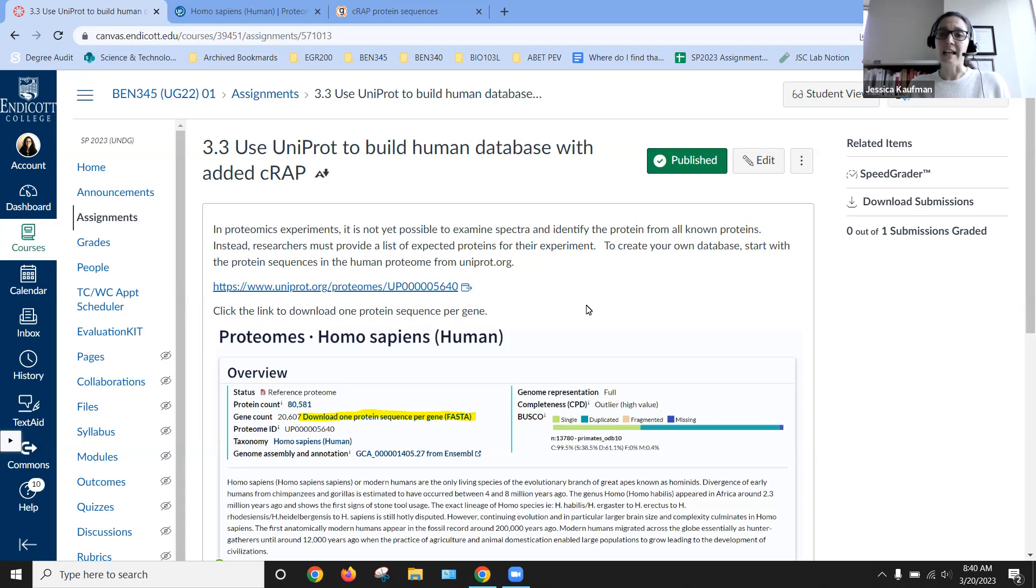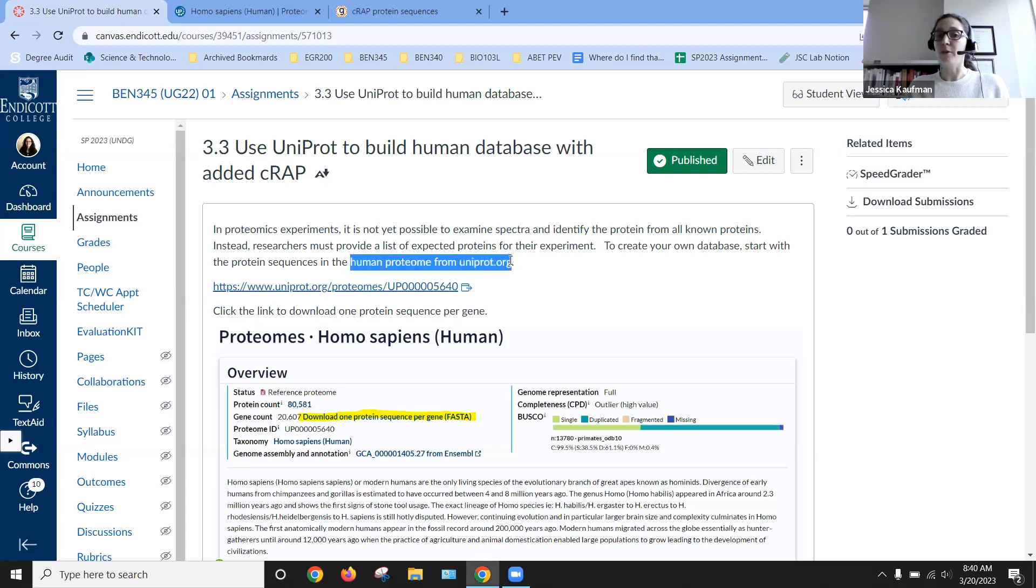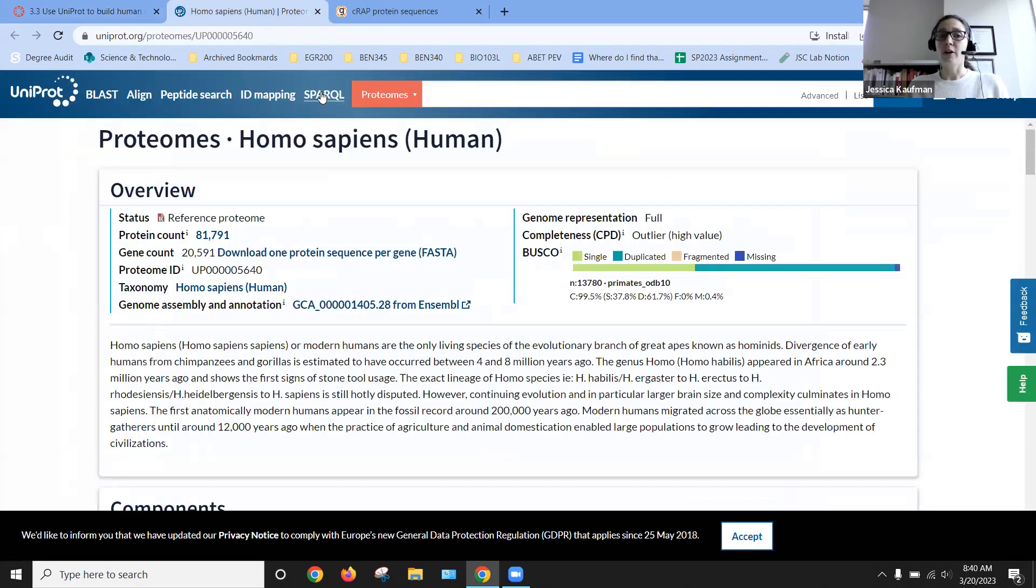So we want to put together a list of all those proteins. Most of them are going to be already put together for us in the human proteome from uniprot.org. So if we go to UniProt, we can look up proteomes.